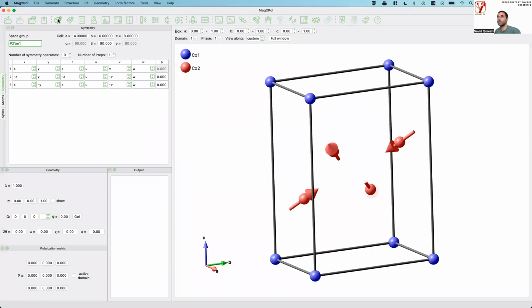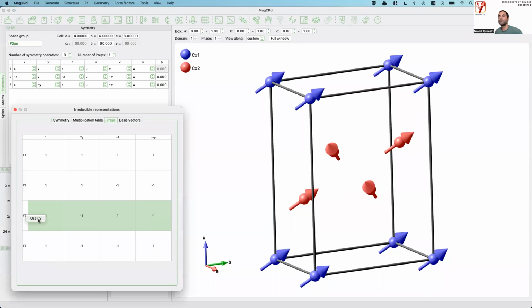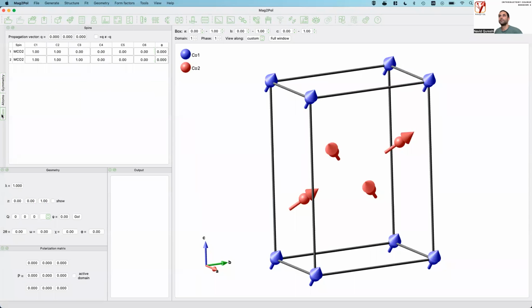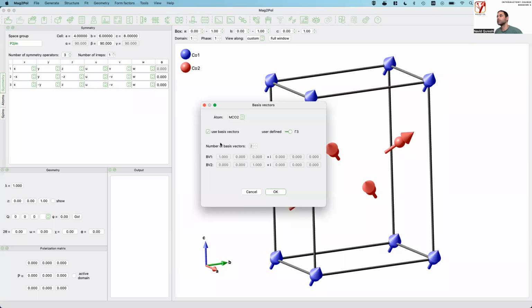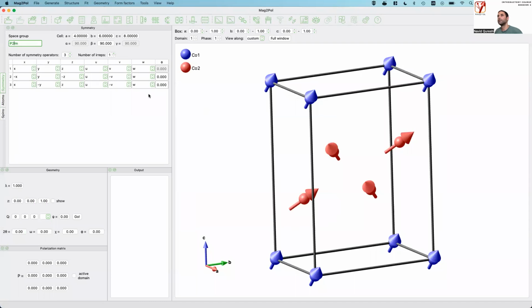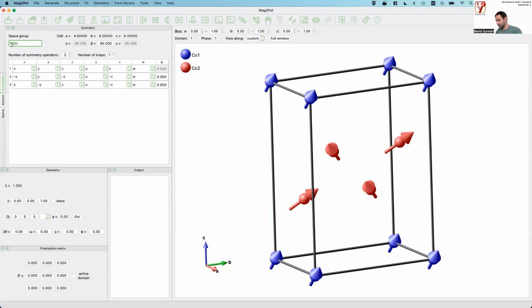And if I generate the unit cell, yeah, that's not what I expected. I'm honest with you. Let's go back. Maybe I did not select gamma 3 in the beginning. So I select gamma 3. And now I check something here. And if I use P2 prime over M prime, now nothing happens because it's exactly the same symmetry.